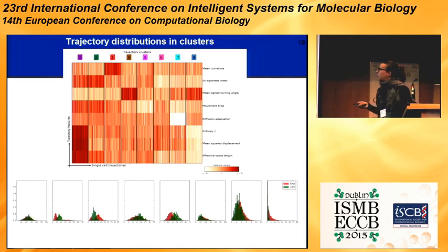But another question that we had following this study was to know whether the exposure of the cells to a small interfering RNA created new motile behaviors. That is, let's say in control videos, you have one main mode of cell motility, and siRNA exposure creates 7 other modes. Or do we simply have a redistribution of the cells in the different clusters following siRNA exposure?